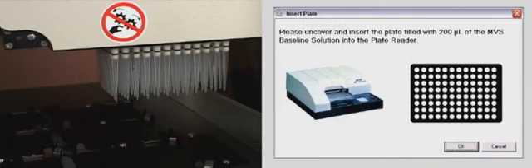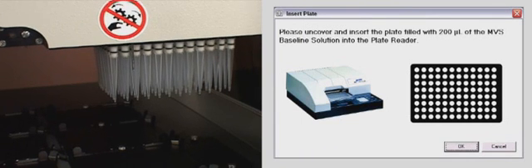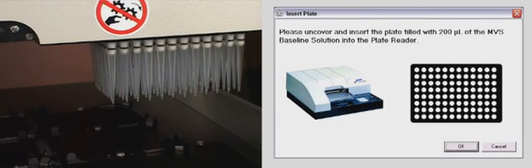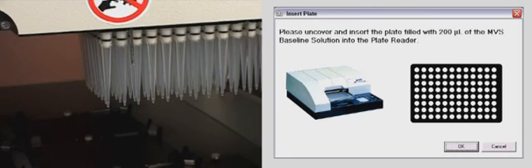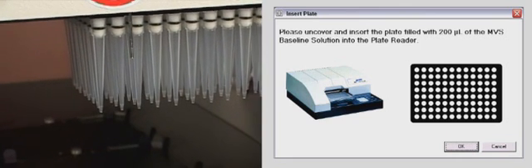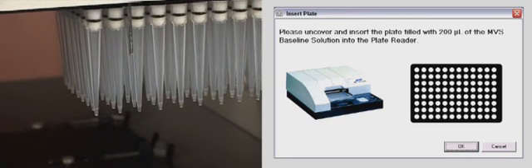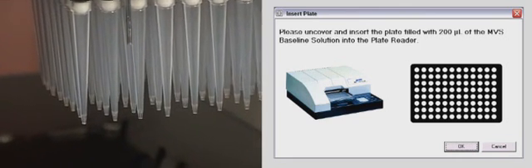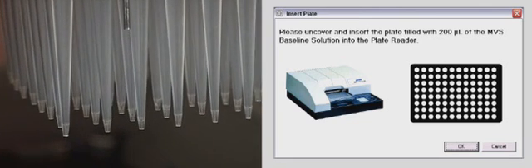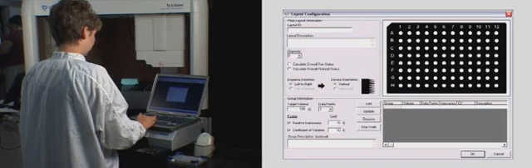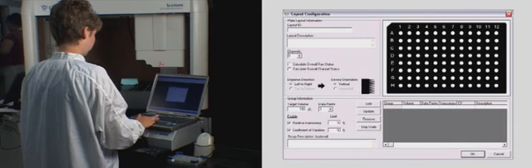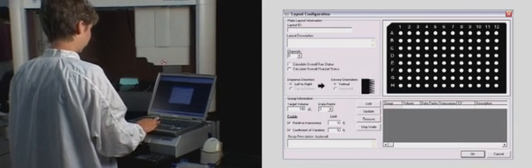Following the plate reader calibration, dispense baseline solution into a verification plate and read the plate reader. The baseline solution provides an optical zero reading and allows the system to remove optical artifacts, such as light scatter, from affecting the volume measurement process. Next, design your plate layout to support your planned testing.